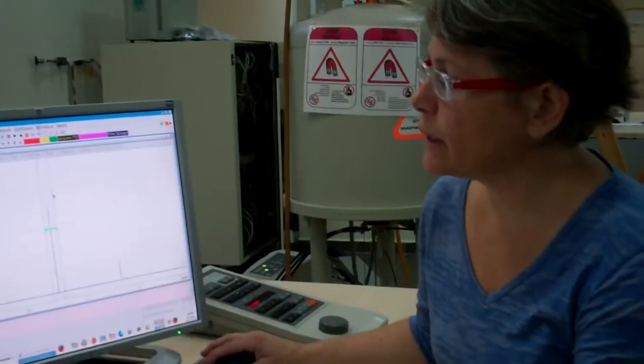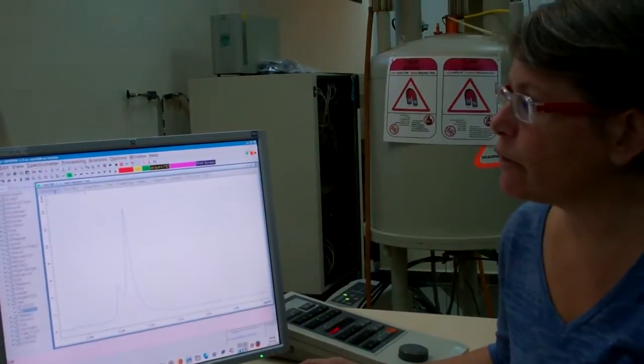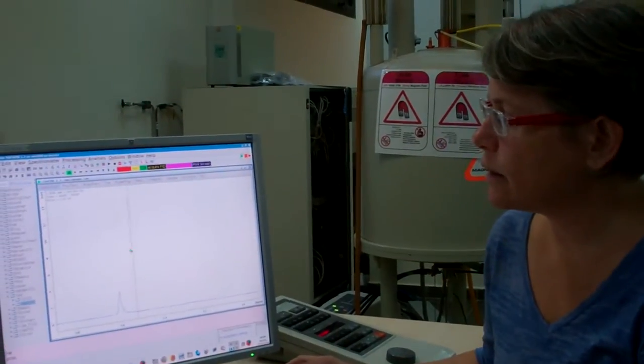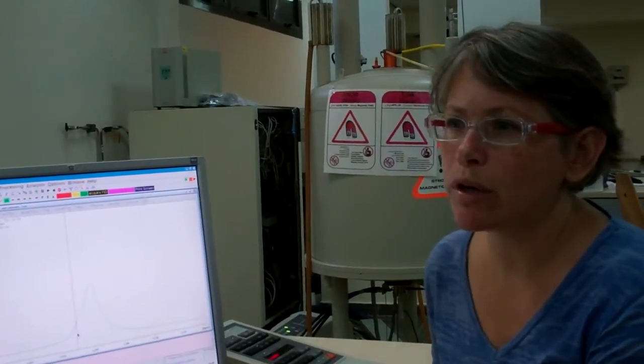Here's our chloroform peak. Uh-oh, what's this little shoulder? That doesn't look like one peak. Let's check every peak in our spectrum. Here's the water peak. It's broader, but it still has the same hint of the same shoulder on the same side.